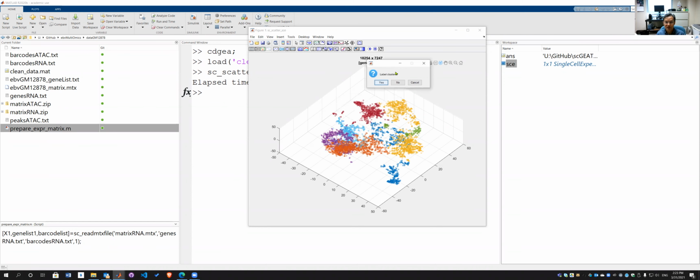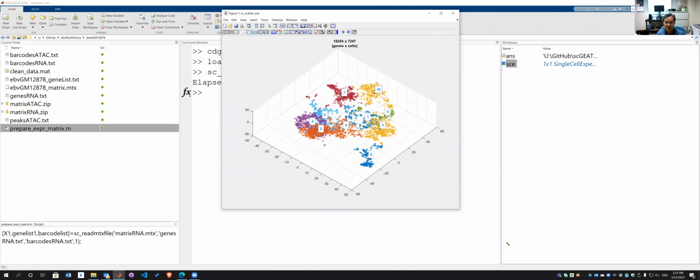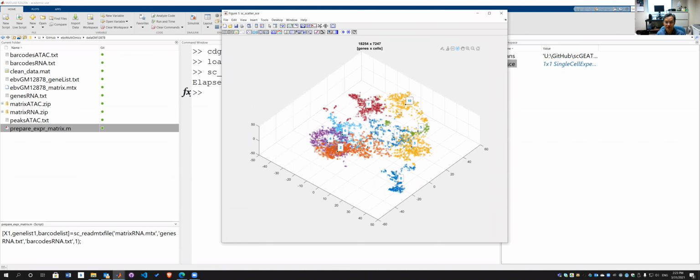And then once it's finished, the program asks whether you want to label these clusters. I can say yes, and I use maybe index or text. Same. Now I have a name for each cluster. The color is sometimes not good enough to differentiate them. Look at this color for group 1, group 8. They are all dark blue, so I don't know. They're so close to each other. That's why the label may be helpful. The 3 and the 10 are the same.